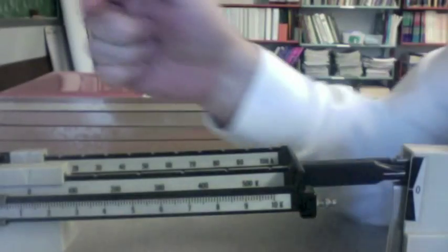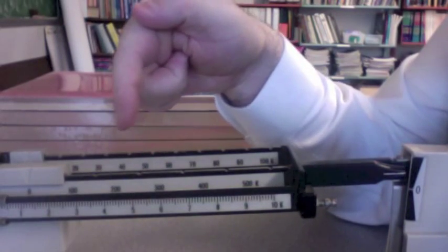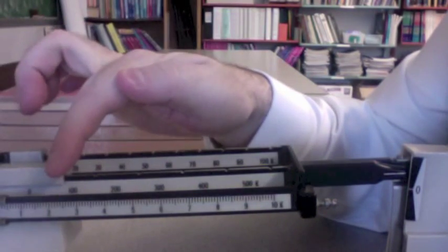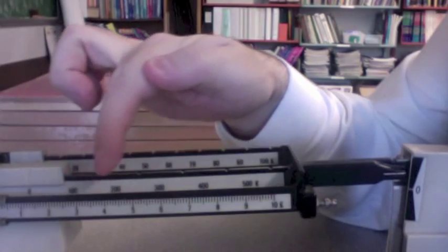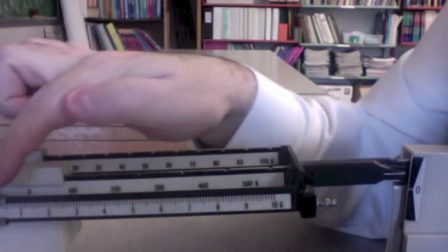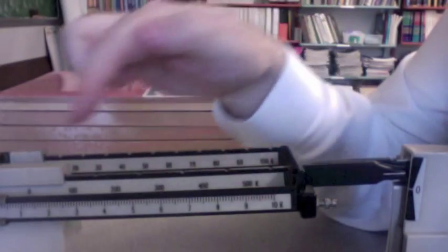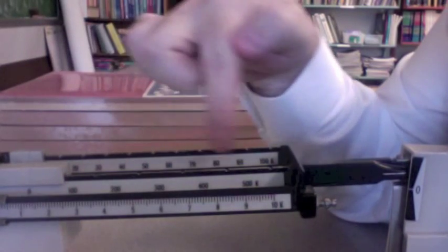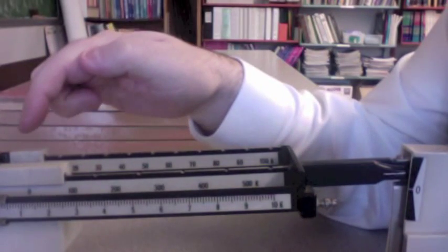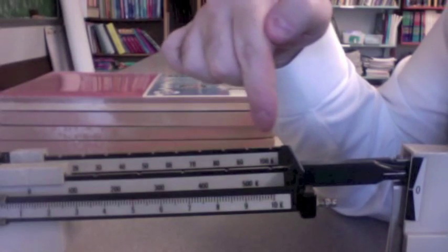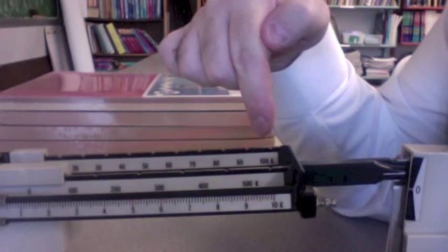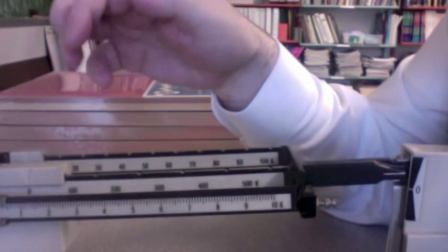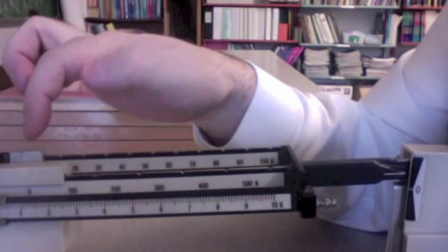You'll notice it's called the triple beam balance because there are three beams here, and we have to look at the beams, and we notice that the first one goes from zero to ten grams. The middle one goes from zero to five hundred grams, and the one in the back goes from zero to one hundred grams. We always start with the biggest slider, so it's the one in the middle.